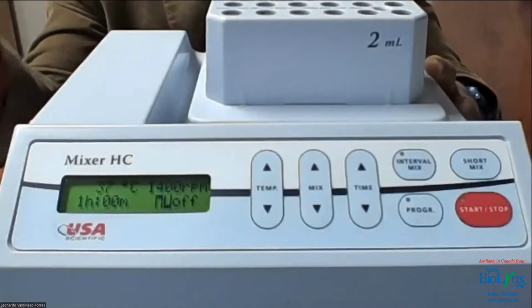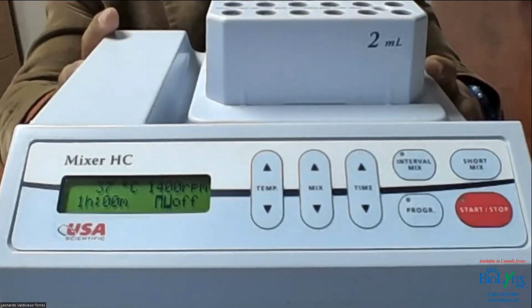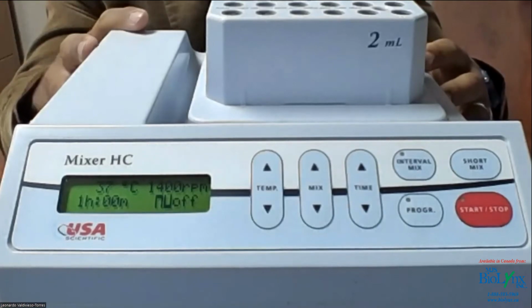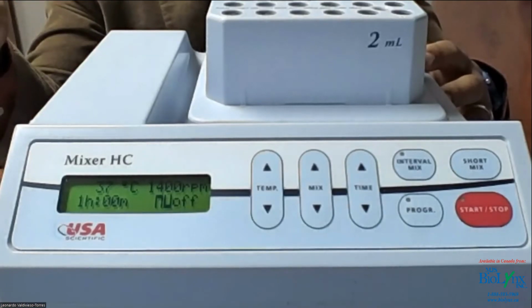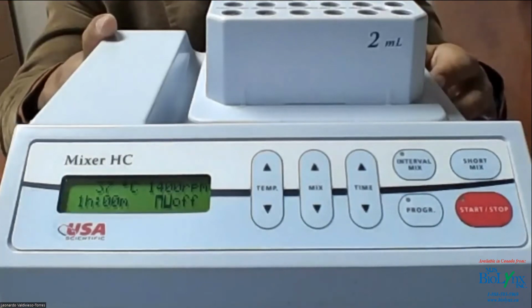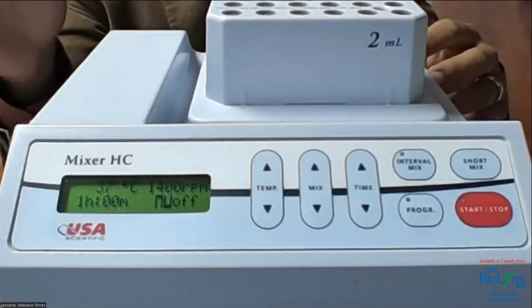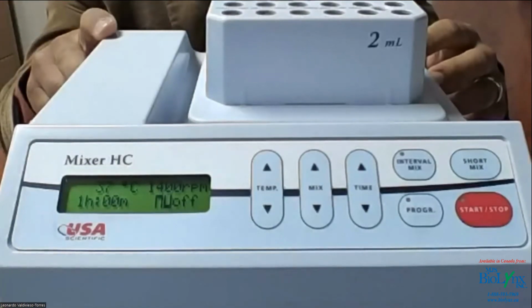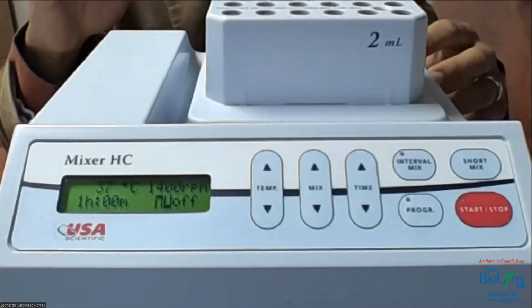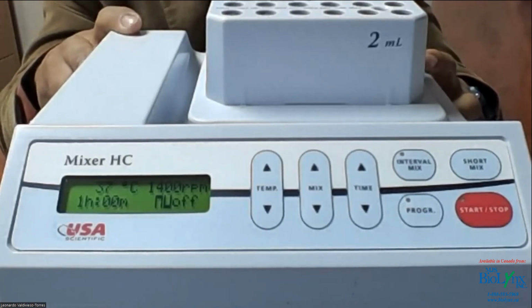We have a heating block that was sold to a customer, and they were asking some questions. They were having trouble with it, but it was not really trouble. They had set it up for one hour to heat and then turn off, and they didn't know they had set it up like that, so they thought it was not working correctly. So I told them to change the time to forever, infinite, so that it would just stay on the whole time. And I told them to put a thermometer to make sure the temperature was correct. It's just a good way to check, but you don't have to always have it on the thermomixer.